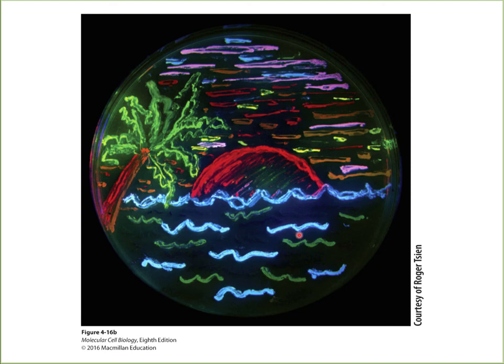Now, how is this picture taken all together? You can see that all these fluorescent proteins are taken together because this is very, very large, and you can visually see that they are spatially separated. But you cannot do this under the light microscope when you are visualizing an individual cell, because it is so small. If you have green or red color together, it is very confusing, and you will not have a specific emission filter which will allow both of them to pass.